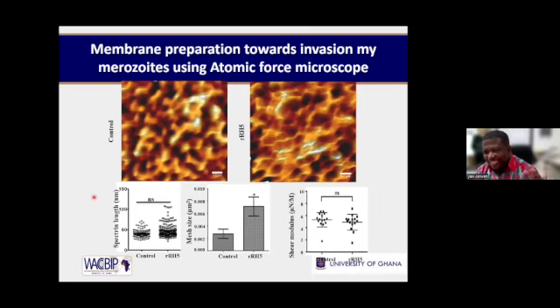Though it is a general principle, being able to see helps you also find different ways of understanding the mechanism and how you will deploy, assuming you want to design an intervention. The other thing is also, aside even from intervention, you need to understand the basic biology of it. The size of the parasite: the invasive form is 1 micron.